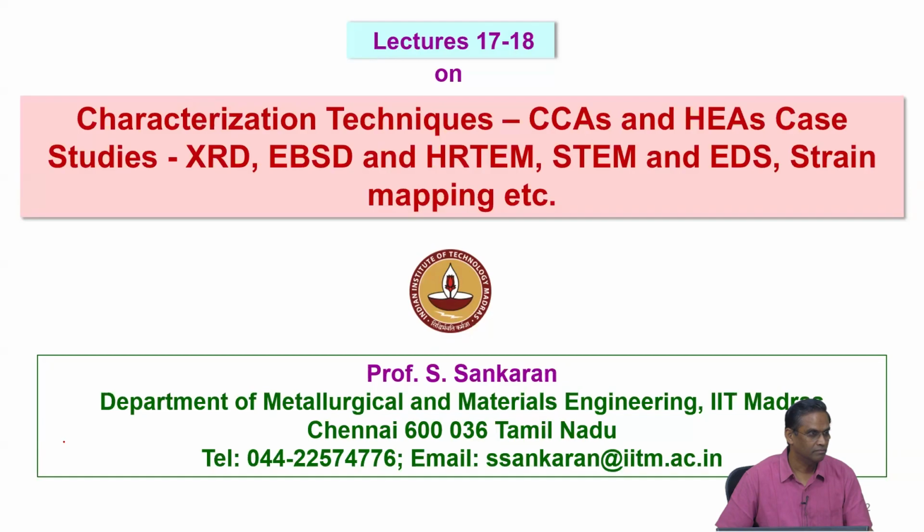synchrotron scattering, synchrotron diffraction, neutron diffraction techniques, where all these elements will have a very sensitive diffraction response. Then you will be able to distinguish between all these 3D transition elements, though they are closely related in atomic number. They have a very close atomic number range. So that is about the diffraction part.